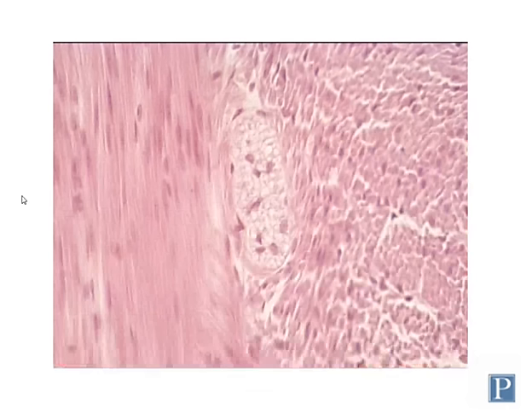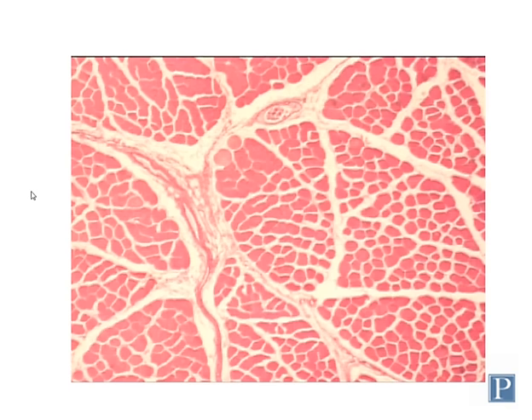So that's smooth muscle. One final note is that smooth muscle gets its name because it has a relatively smooth appearance, whereas cardiac muscle and skeletal muscle, if viewed appropriately, have very obvious striations to them. And so smooth muscle is non-striated, while skeletal and cardiac muscle is striated when viewed in longitudinal section.